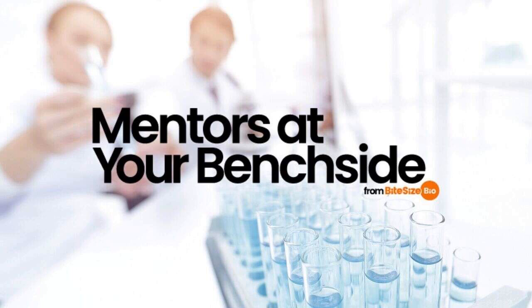So what can different controls for immunofluorescence tell you? The type of control you use will depend on the purpose of your immunofluorescence experiment. For example, if you're trying to verify knockout cell lines, it's important to establish the specificity of your antibody. So let's go through 5 types of control and what they tell you.